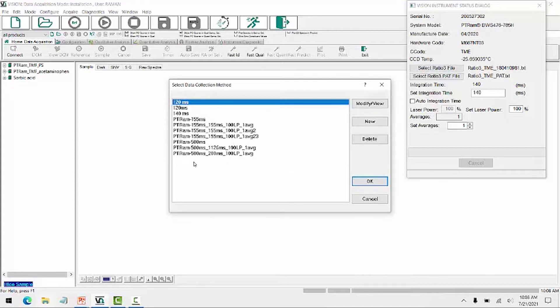It's bringing up the instrument status dialog with the identifying information of my instrument, as well as the different DCMs that have already been saved within this project. So within the status dialog, I see that I have a PTRAM connected, and I have the identifying information, the ratio of three files, integration time, and such.